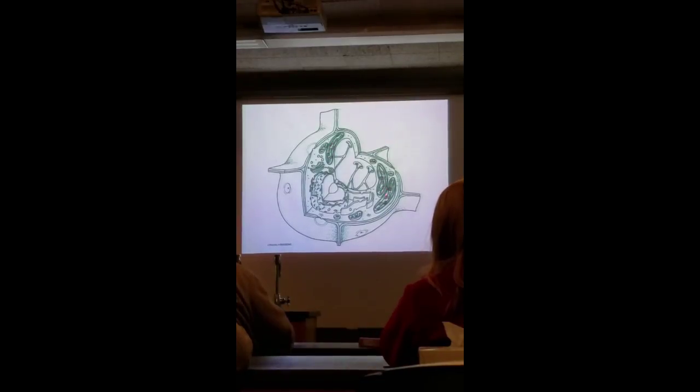This is chloroplast, and this is the mitochondria, and this is the Golgi apparatus, also known as the dictyosome, and I would take either of those. How about these free-floating things right here? Ribosomes.